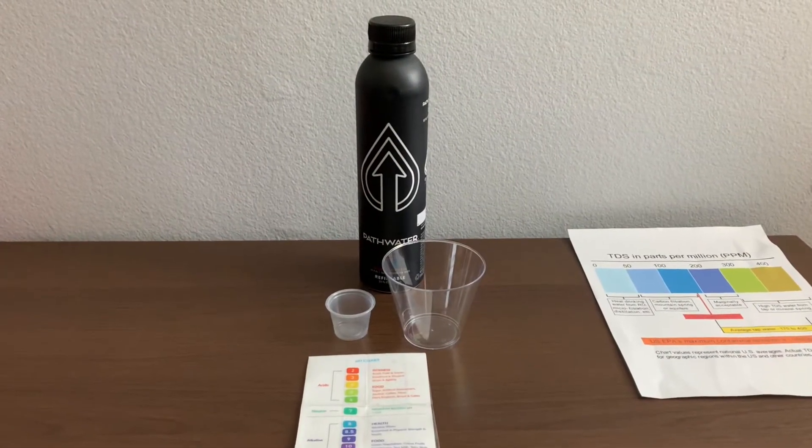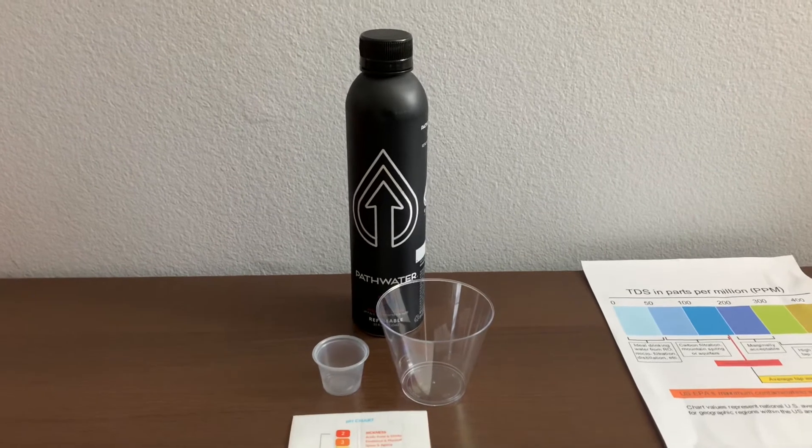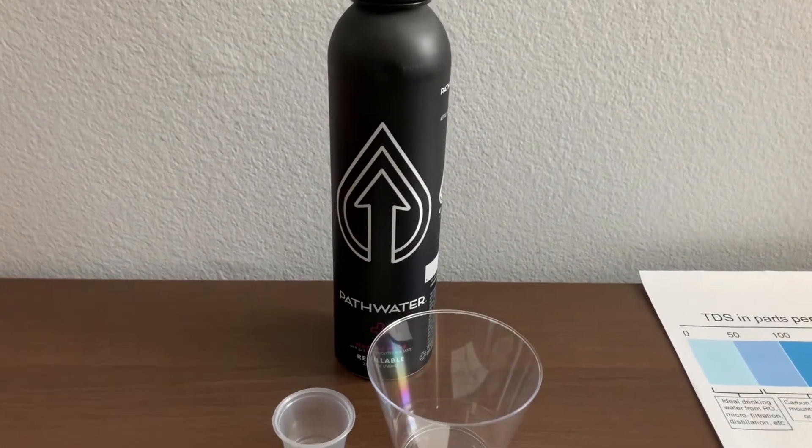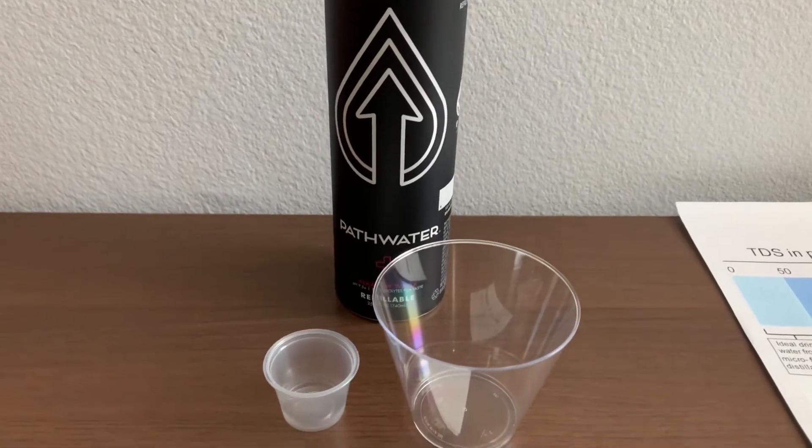PathWater is alkaline water infused with electrolytes for taste. The pH balance is supposed to be 9.5 or higher. It comes with a refillable bottle and costs $2.79.